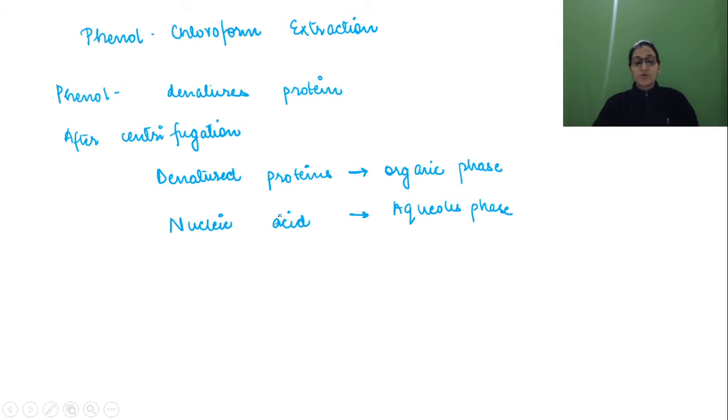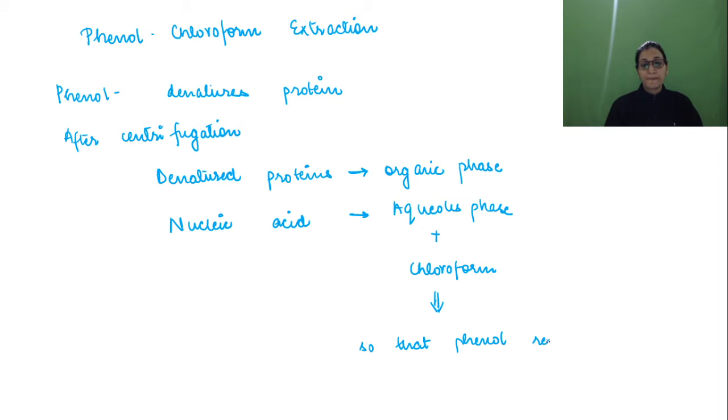Right. So this aqueous phase will be mixed with chloroform, so that the phenol residues can be removed.